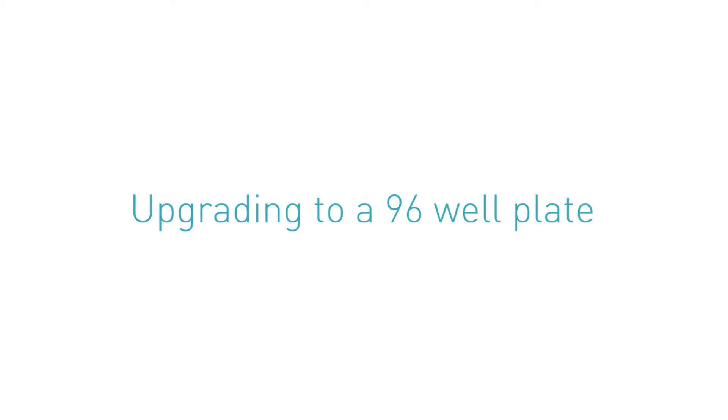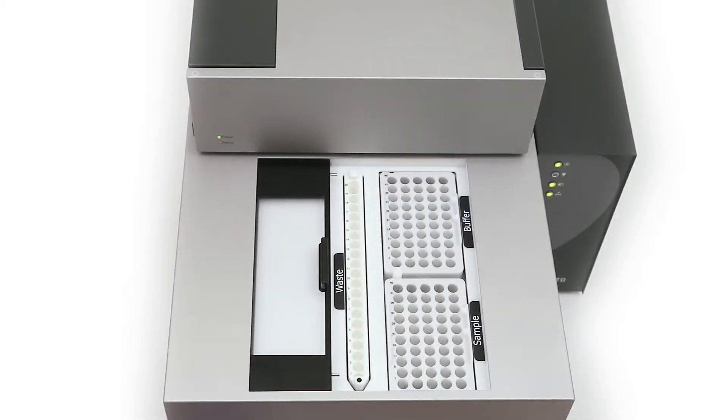Upgrading to a 96 Well Plate. Gently pull the vial tray out of the autosampler and put to one side.